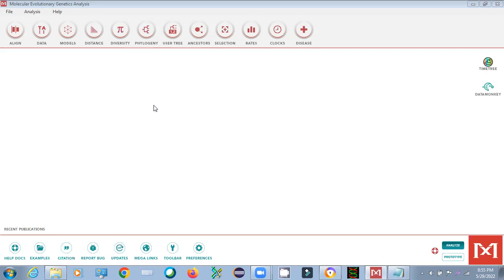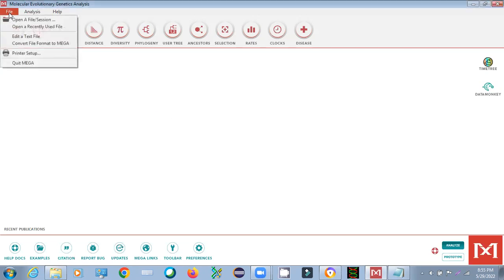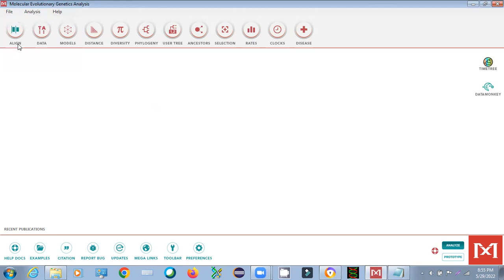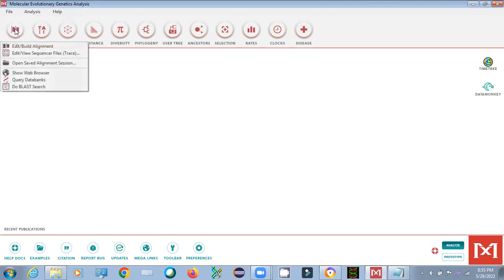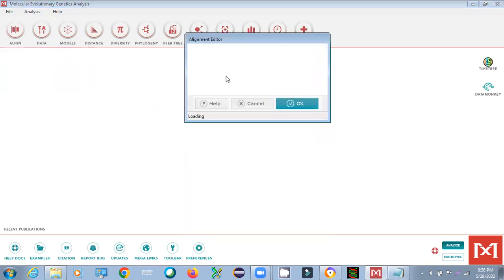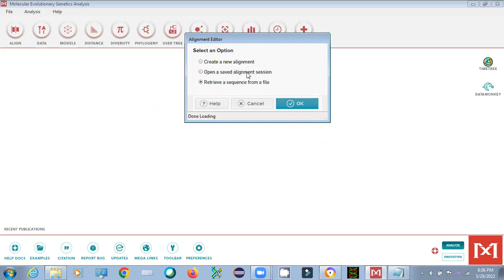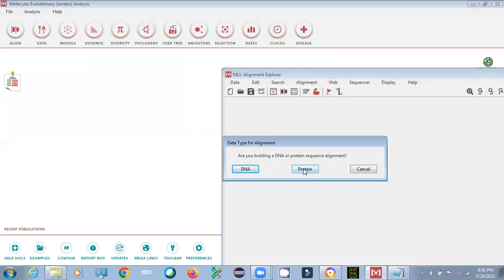To start, open your MEGA software. You will see an option called 'Alignment' — press that and select 'Build Alignment.' Options will appear asking whether to open a previous alignment session or create a new alignment. Since we are learning alignment, select 'Create New Alignment' and press OK. Our sequence is protein; if you have DNA, you can select DNA accordingly.